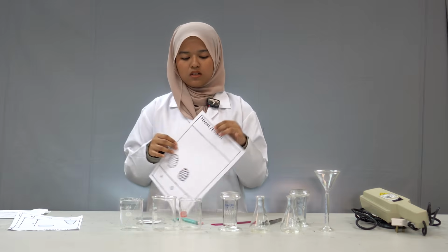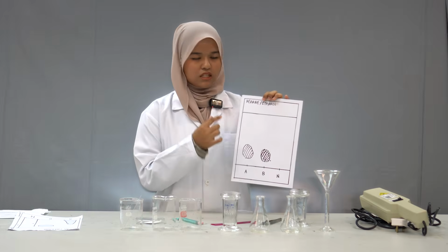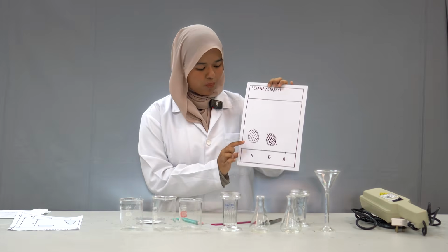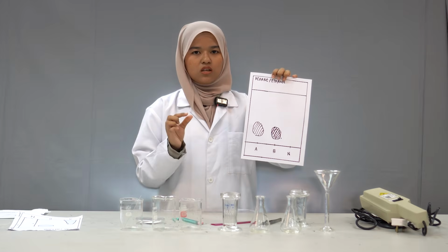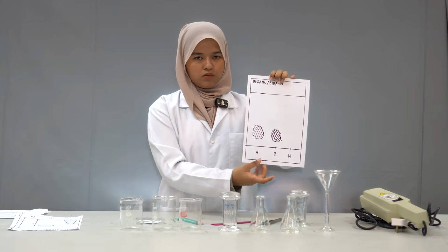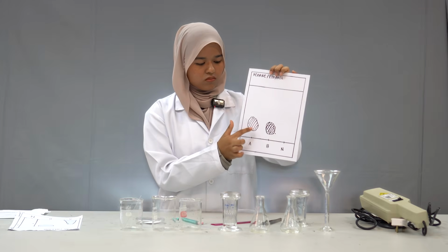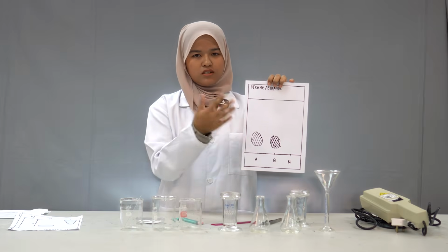Meanwhile, the hexane and ethanol are non-polar solvents. So when it is non-polar, our polar acid and base will interact with the silica gel, so they will not move further.